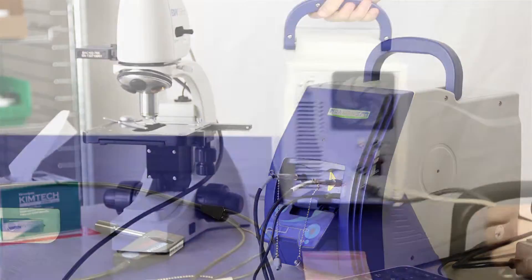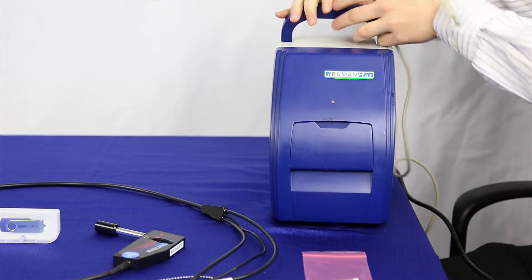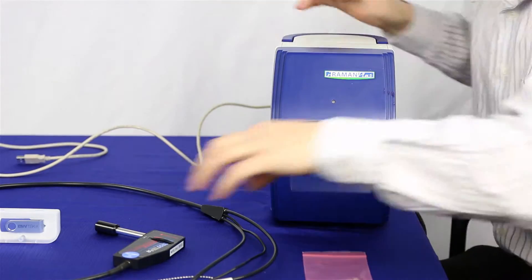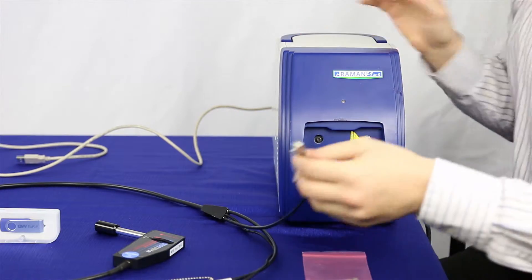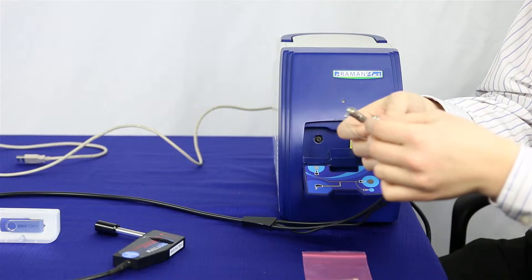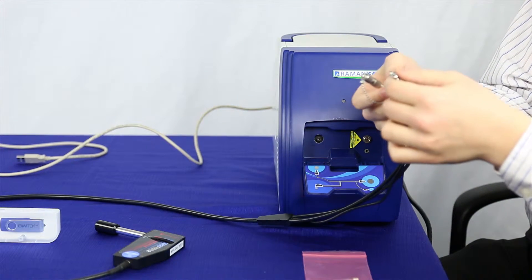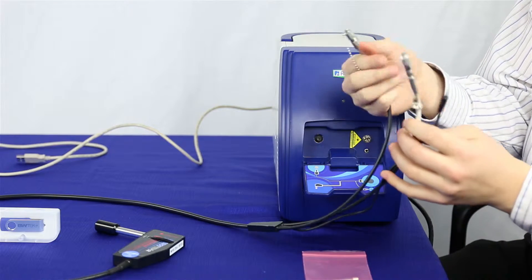Now that everything's plugged in, we're going to turn it around and we're going to work on the front. You're going to open the flap and you're going to take your Raman Probe. You'll see your Raman Probe has two different fibers: one is your collection fiber and one is your excitation fiber.